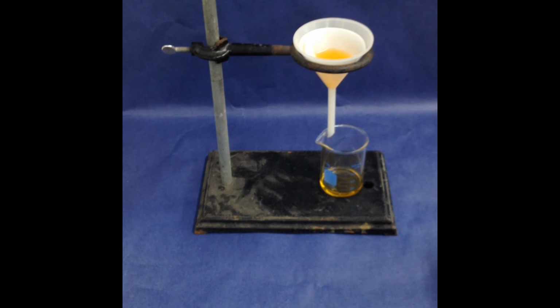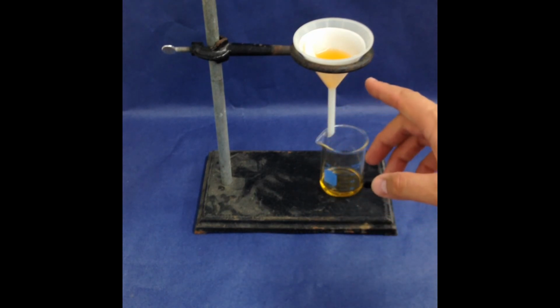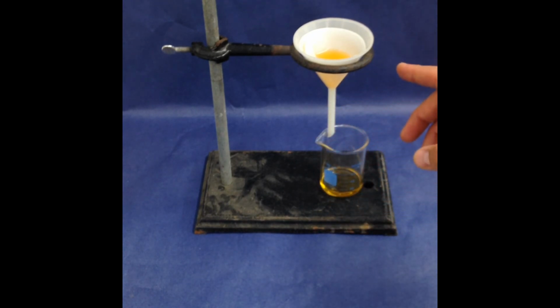This prevents splashing, and let's say that you had maybe an acid or a very strong basic solution here. This will reduce the chances of splattering so that it doesn't get on some other person. Okay, so those are the uses for the funnel.